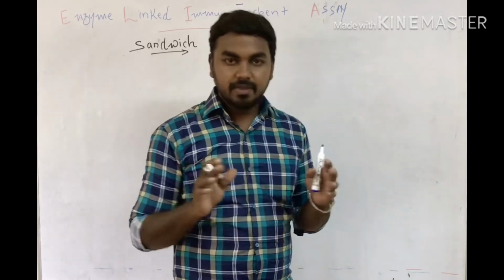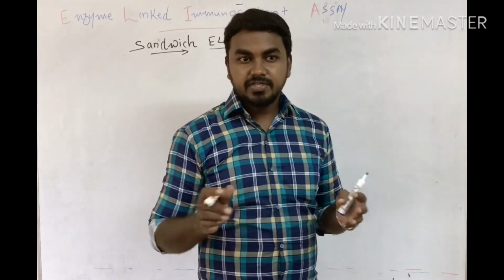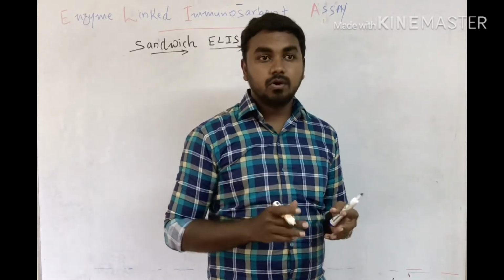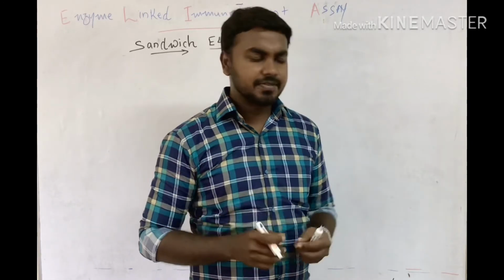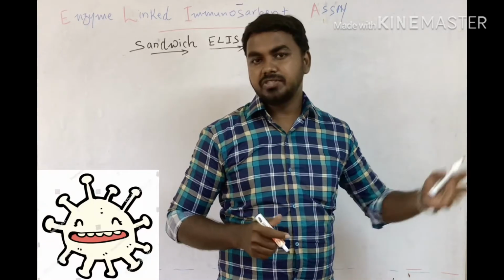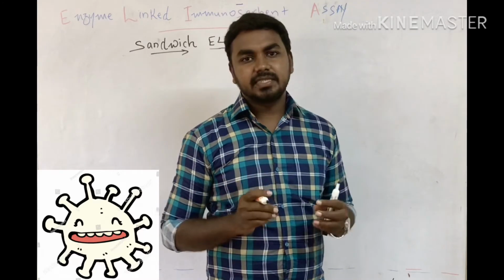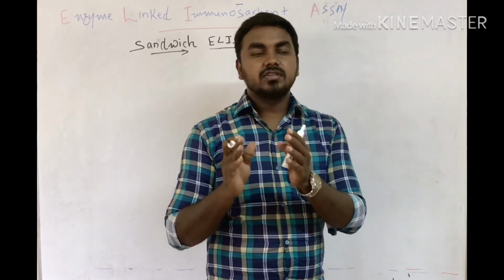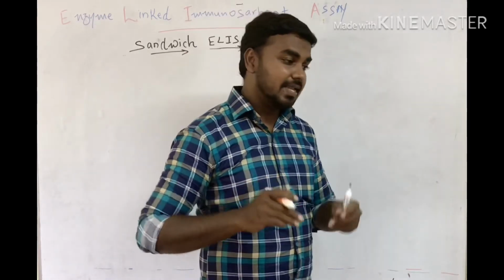Why do we need ELISA? That's a very big question. What can we do, what are the applications? If you have any disease, we can detect it through ELISA. We can even quantify the hormone level in your body. For that we need certain techniques, right? For example, if you are infected with any antigens, the foreign particle, those antigens can be easily detected through this technique. So easily we can say whether you are infected with a certain virus or bacteria or whatever. That's the reason we need this ELISA.